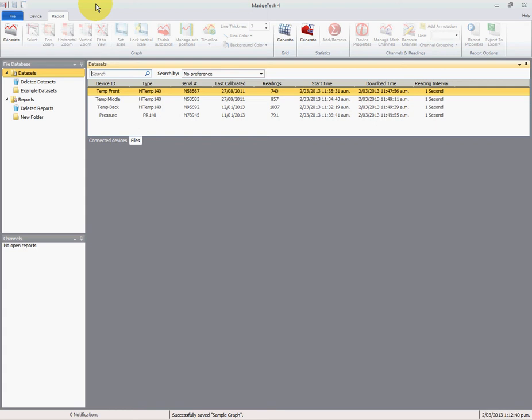Hi, my name is Phil Ruby. I'm the Magitech Specialist for Advanced Technical Services. I'm going to give you a short video on how to create a graph from the data that you've already recorded.